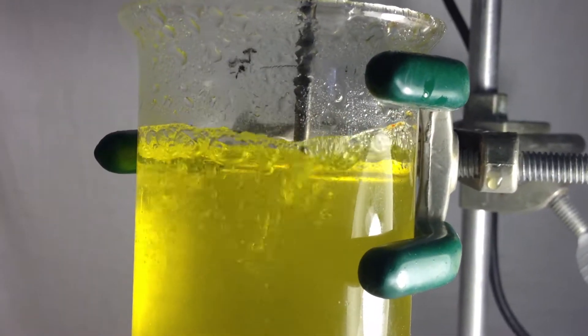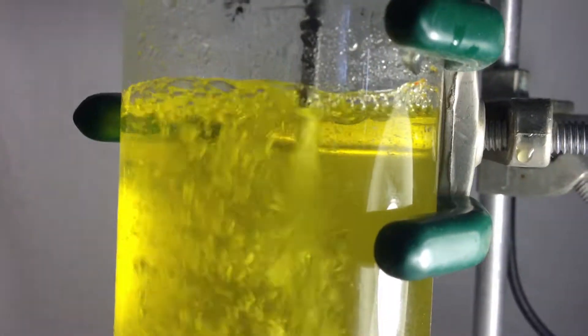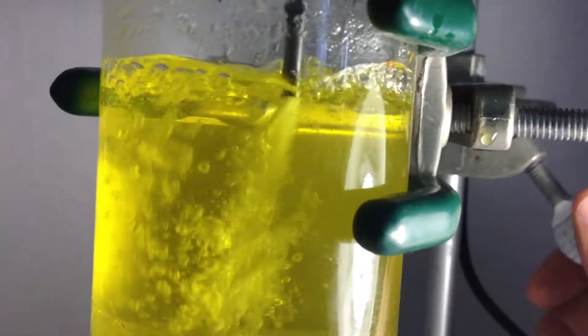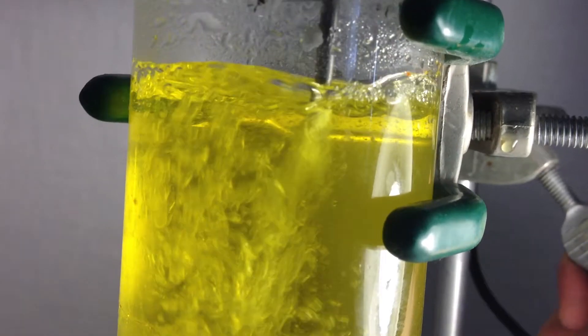As you can see, depending on the position of the tip, you can see different types of vibration and you can adjust it and use it for clearing, cell rupture, and everything.